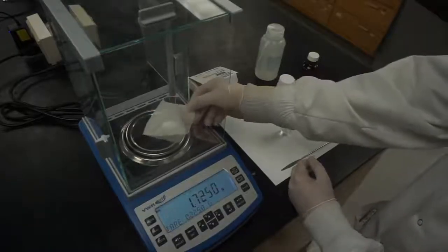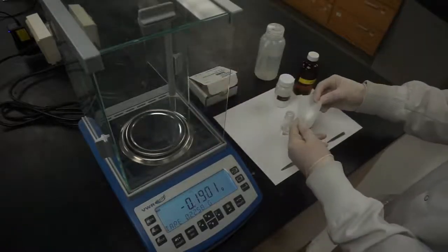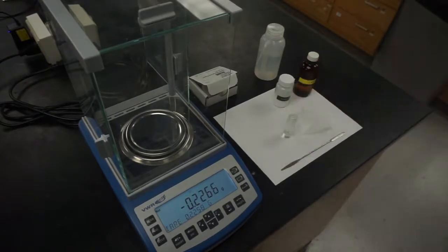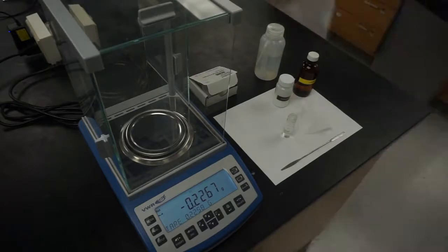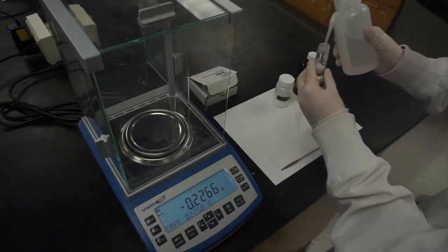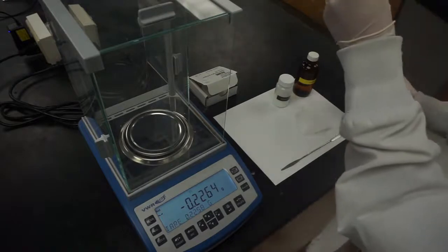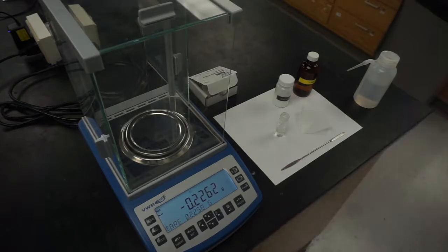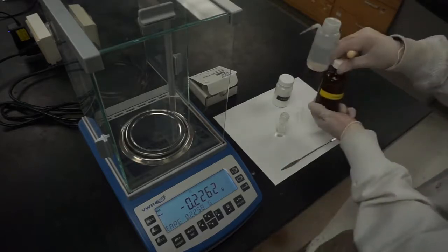Then, gently transfer the sodium bromide into a 5-milliliter conical vial with a spin vane in it, and add about 1 milliliter of DI water and 1 milliliter of 1-butanol to the conical vial.